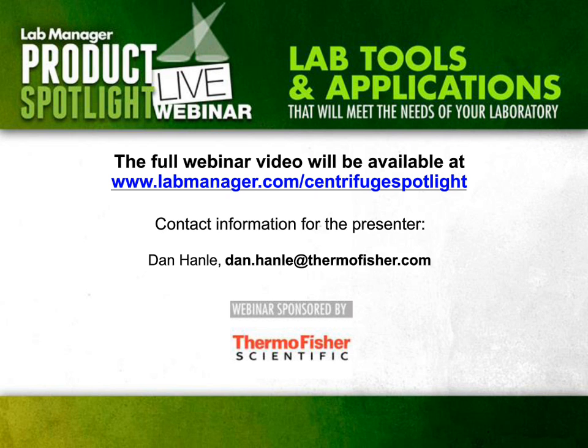Now, sometimes people will hold up a tube and everyone's looking at it like, that's new or that's different. In that case, what we do is we try to match that to some of the myriad adapters that I was mentioning earlier that we use in some of these centrifuges and find one to match that. And occasionally there'll be a new thing coming along and we'll need to go back and innovate and come up with a new adapter or something, and we'll do that too. That's not that common, but it does happen. People come up with it.